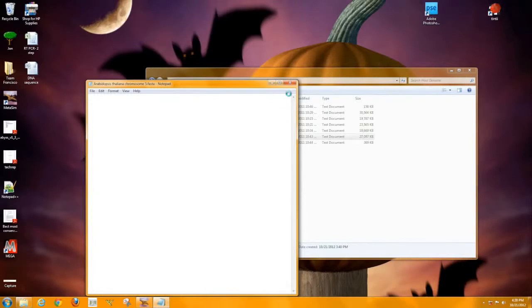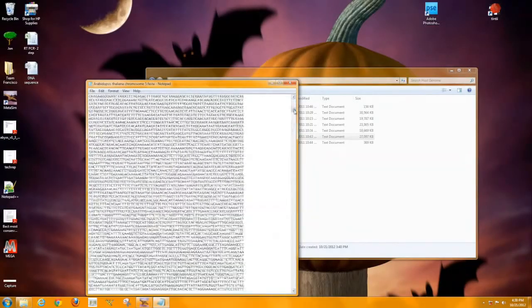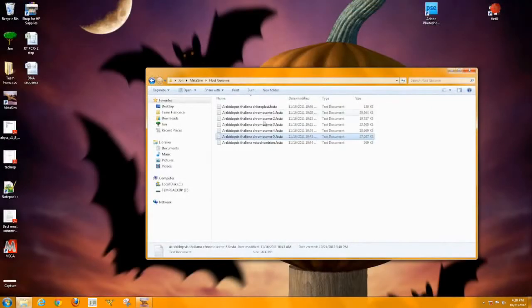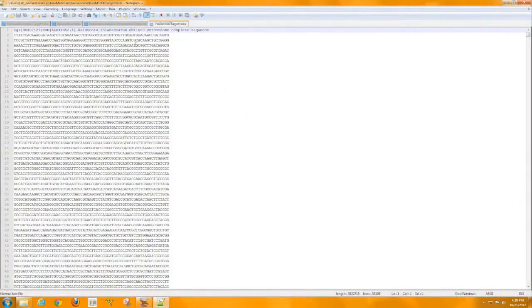I've used soil as a host before, and we've used various foods as hosts. So it really doesn't matter. You just want a host that either provides you a good background or that is relevant to whatever the pathogen is that you're looking at. And so the bacteria I used for the purpose of this illustration is Ralstonia. I did download the entire genome of this Ralstonia, and I believe it's GMI1000.